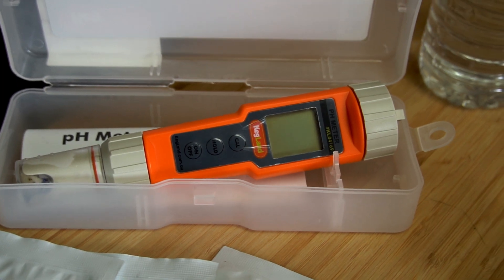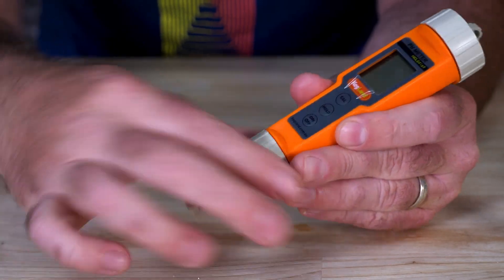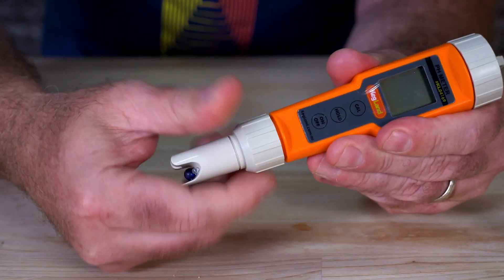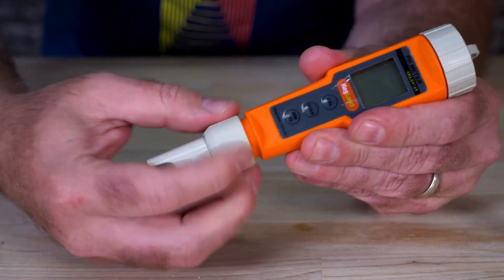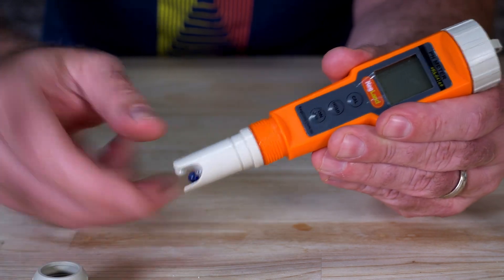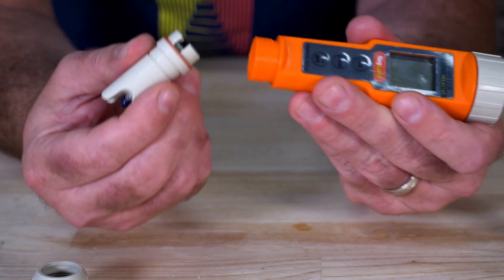Even the most well-maintained pH meters, the probe is going to fail over time. And that's one of the reasons I like this model — replacing the probe is simple and easy. First, you remove the O-ring, unscrew the cap, then gently pull it out. With the new probe, make sure you're inserting it in the right direction — there's only one way for it to go in. Gently insert it, screw the cap back on, and put on your O-ring. That easy.